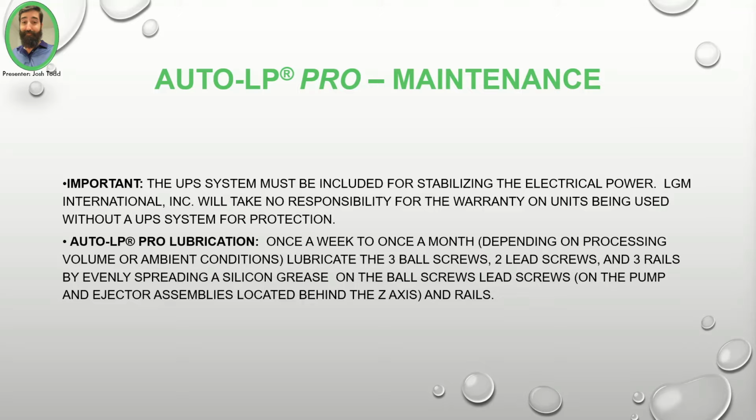AutoLP Pro Maintenance. Important. The UPS system must be included for stabilizing the electrical power. LGM International will take no responsibility for the warranty on units being used without UPS systems for protection.